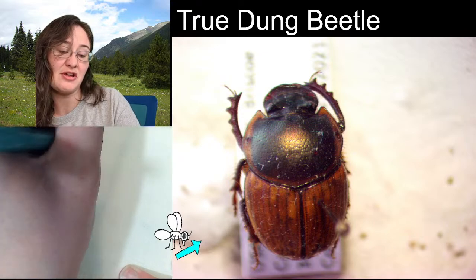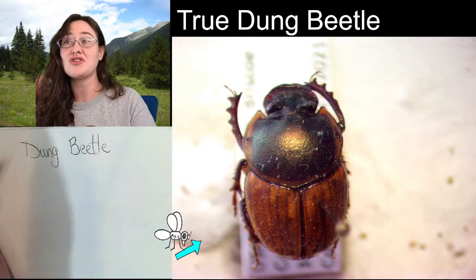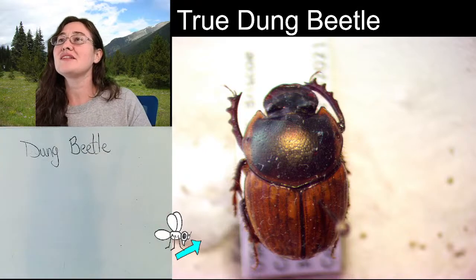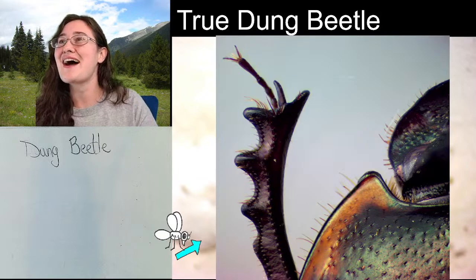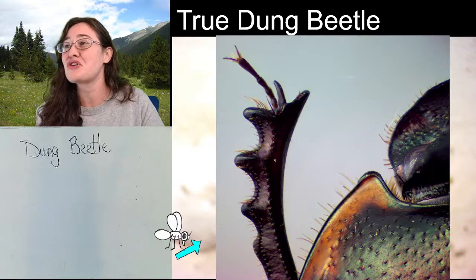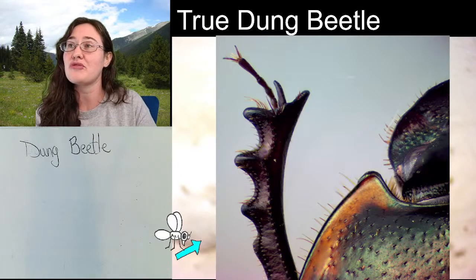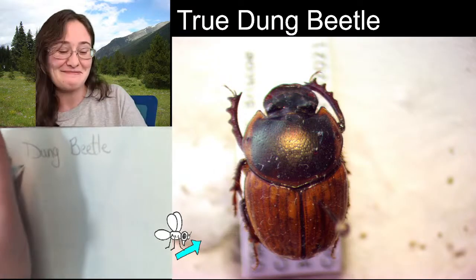And this beetle is really gorgeous. It has, once we zoom in, you'll see it's slightly iridescent. If you look at this leg picture, this is a picture from my microscope, and it has these really beautiful iridescence on the pronotum, and this does follow all the way through up into the head, too. So when we zoom in, it's going to be awesome. I'm excited about it.